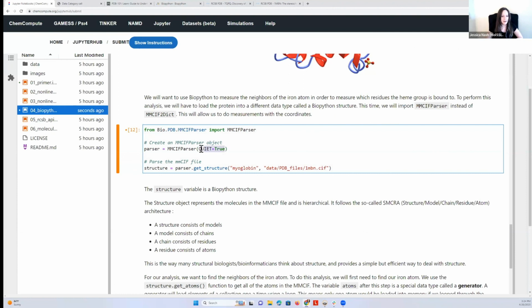For some structures, it will print a lot of information for you when it's reading it. So I just put quiet. Can we write inplace equals true? You cannot. In place is something that's special for a pandas data frame. Oh, okay, it modifies the data frame in place. Okay, thank you so much.